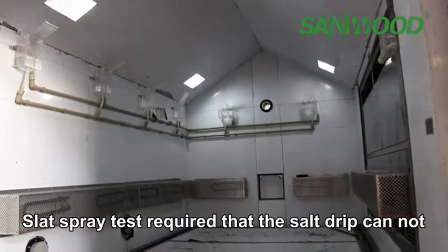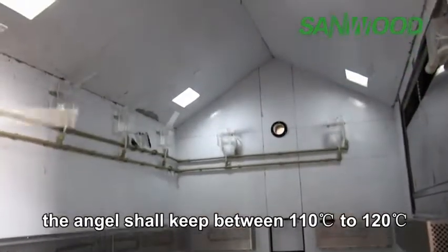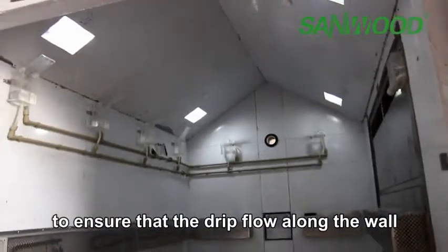The door is equipped with rubber strippers for excellent sealing performance, to guarantee that the salt mist does not escape. Salt spray testing requires that the salt drip cannot fall on the test sample. The angle shall be between 110 degrees to 120 degrees to ensure that the drip flows along the wall.